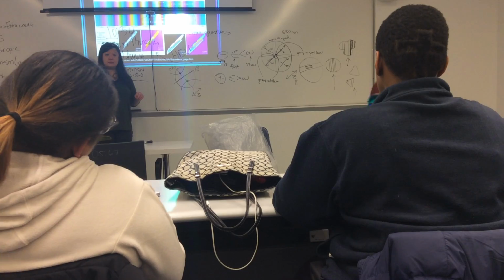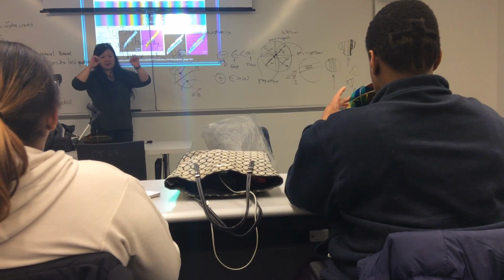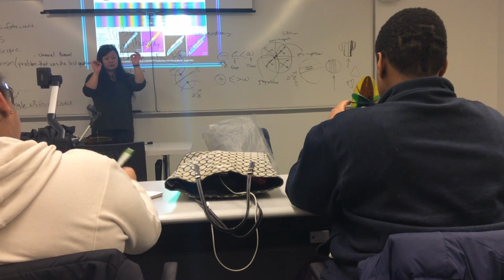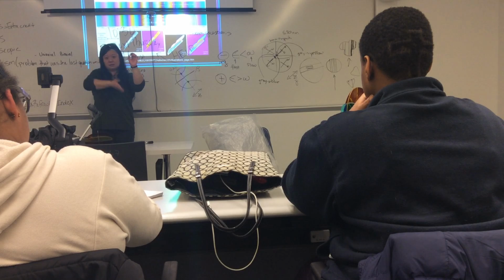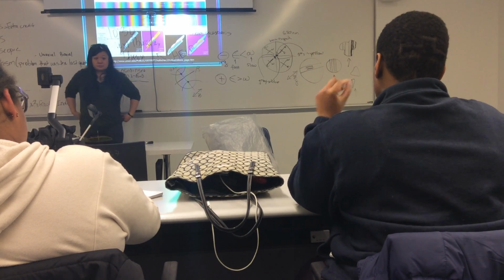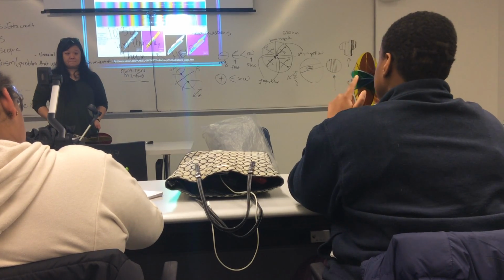So the way I find the direction of the optic axial plane is I look for those isogyres, those brushes. Those melatopes are right at the center of those brushes. I connect a line to connect those melatopes, or the centers of the brushes. That's the trace of my optic axial plane. Make a perpendicular line, that's beta. So beta is always perpendicular to the trace. Okay. So in this case, this would be beta?